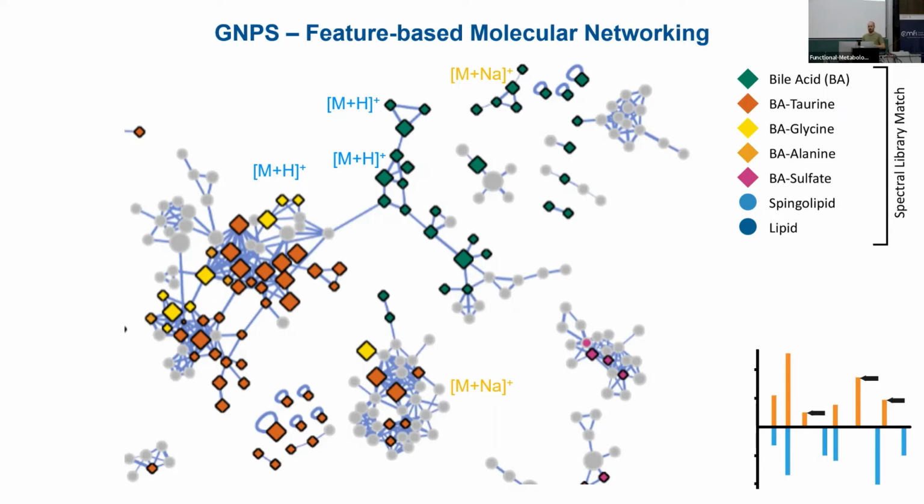So again, it's important to keep in mind that's one way of looking at the data. We can say that most of the time, the modified cosine similarity is more towards single modifications. And then of course, traversing the graph, we might have a single modification and again a modification on a different side, and then you come to multiple modifications over the graph. But other metrics might be better, for example, for very complex multiple modifications.